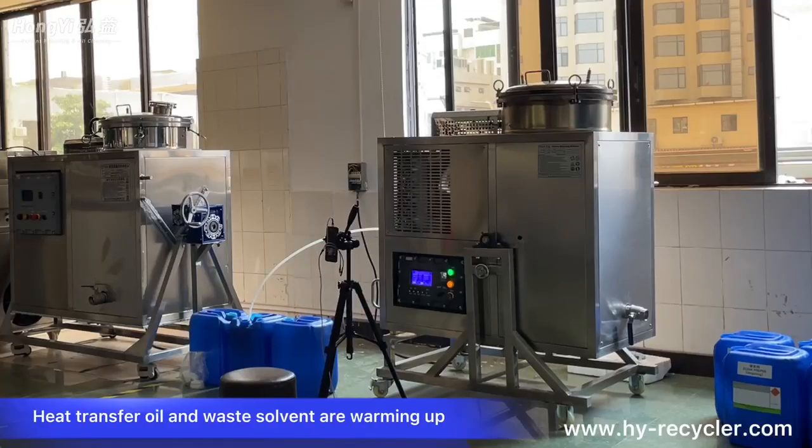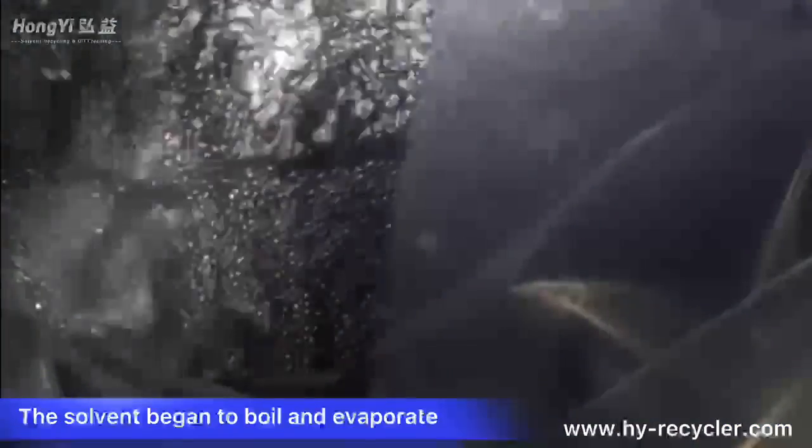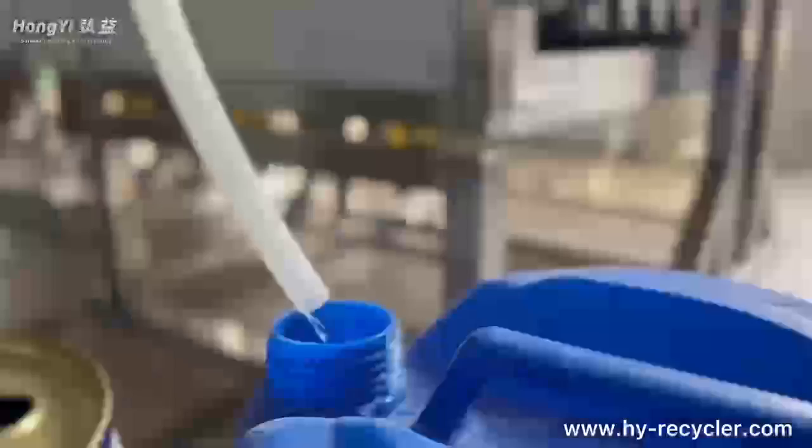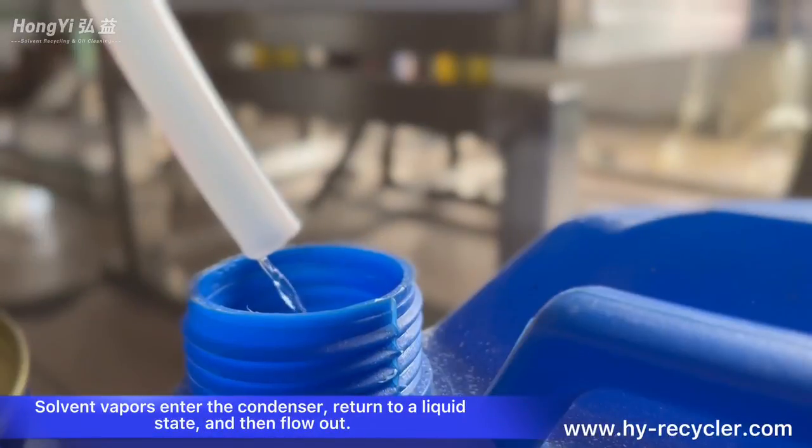The heat transfer oil and waste solvent begin warming up. The solvent starts to boil and evaporate. Solvent vapors flow into the condenser, return to a liquid state, and then flow out.